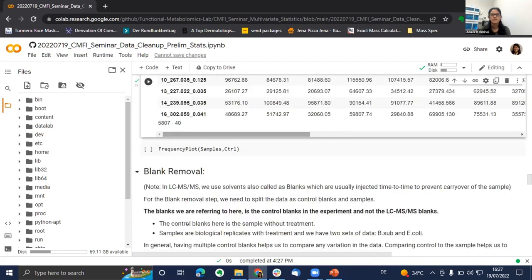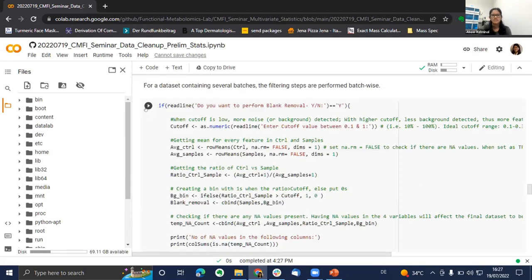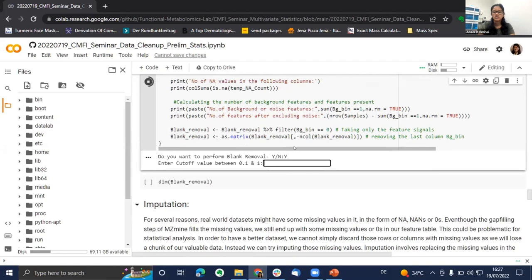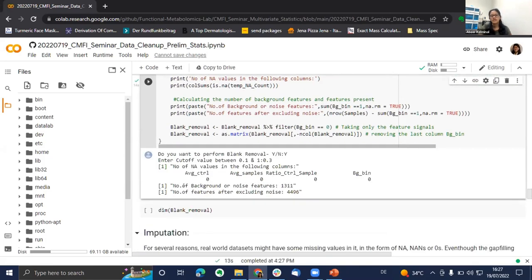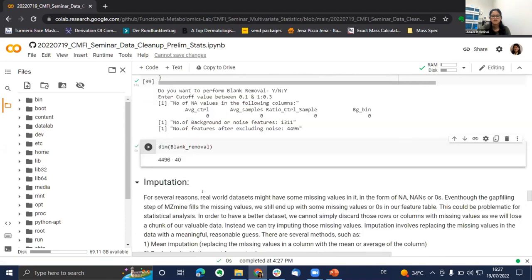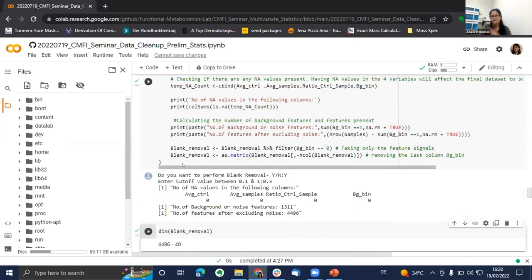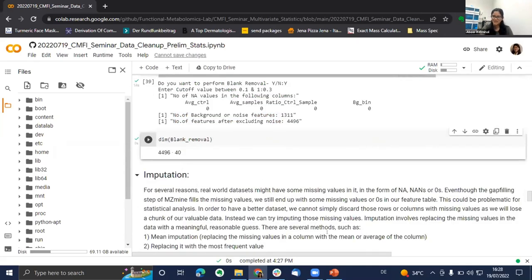Now we split into blanks and samples. I created a function that shows a basic overview of the metadata and its attributes. You enter the index of the attribute to split samples and controls — for us that's column 2, 'attribute sample type,' with levels: without treatment, with treatment, and blank. I enter the index for blanks and it splits into 2 blank columns and 40 sample columns. So we're also performing blank removal: enter yes, give a cutoff of 0.3. The number of background noise features removed is 1,311, reducing from ~5,800 features to ~4,400. I hand it back to Daniel.